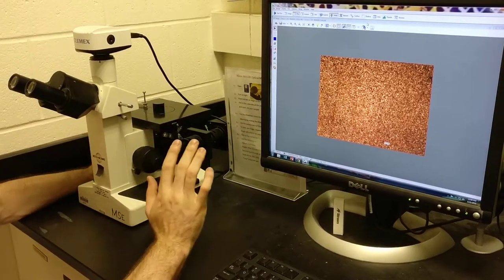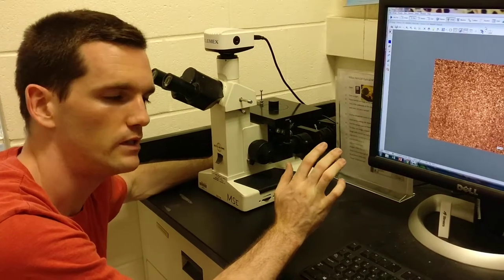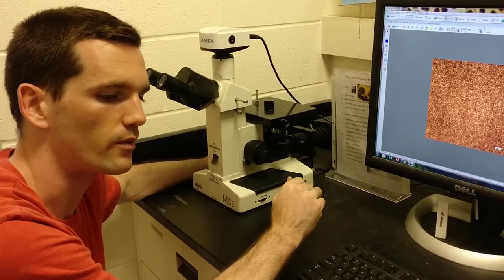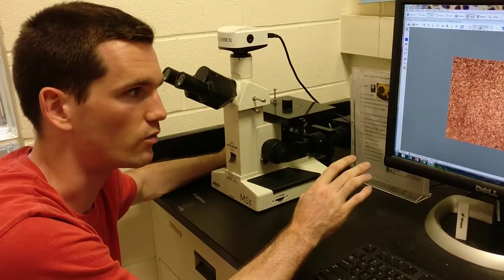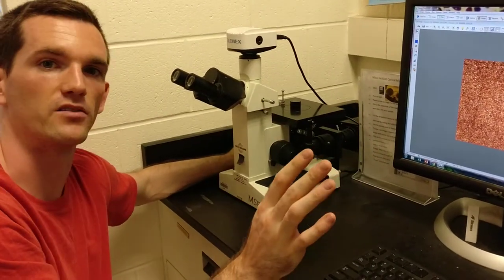We're going to start on the lowest magnification, or 50x, just to find our sample. This is a good thing if we want to find an edge, a specific feature, and to make sure that what we're looking at is represented across the entire sample.